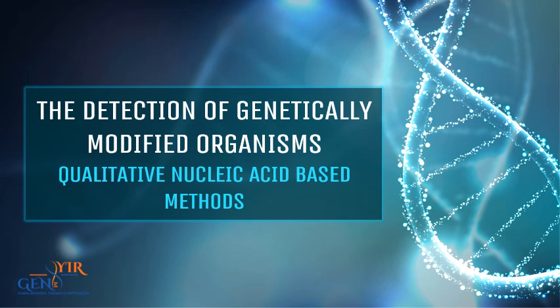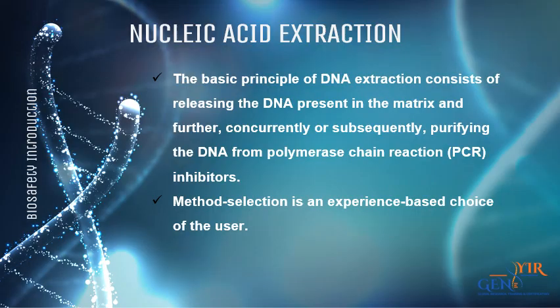Methods of analysis for the detection of genetically modified organisms. Qualitative nucleic acid-based methods. Nucleic acid extraction. DNA extraction. The basic principle of DNA extraction consists of releasing the DNA present in the matrix, and further concurrently or subsequently, purifying the DNA from polymerase chain reaction inhibitors. Method selection is an experience-based choice of the user.